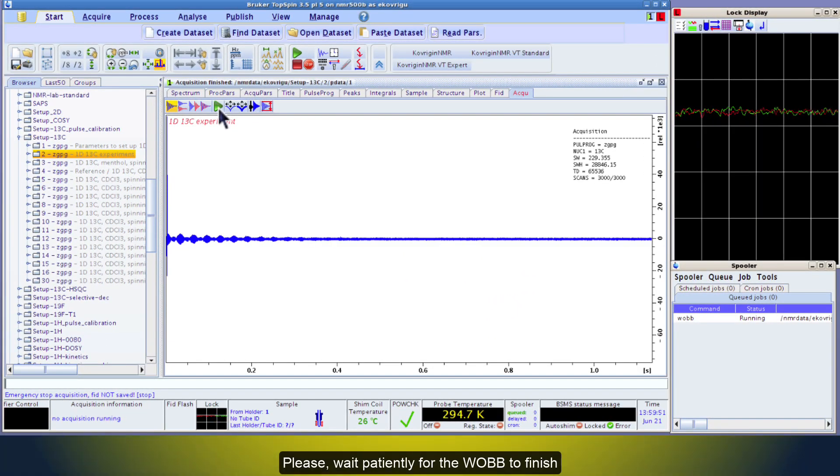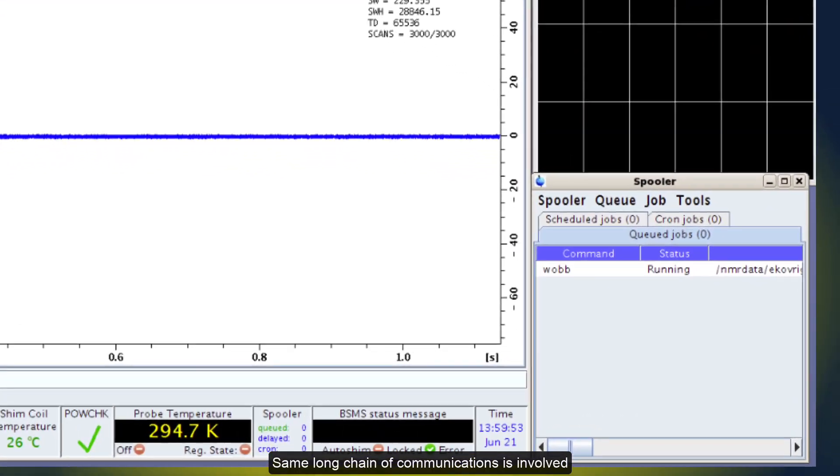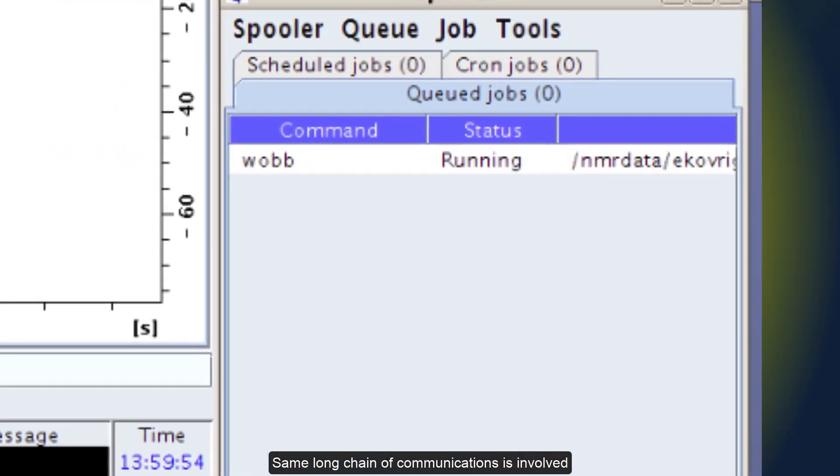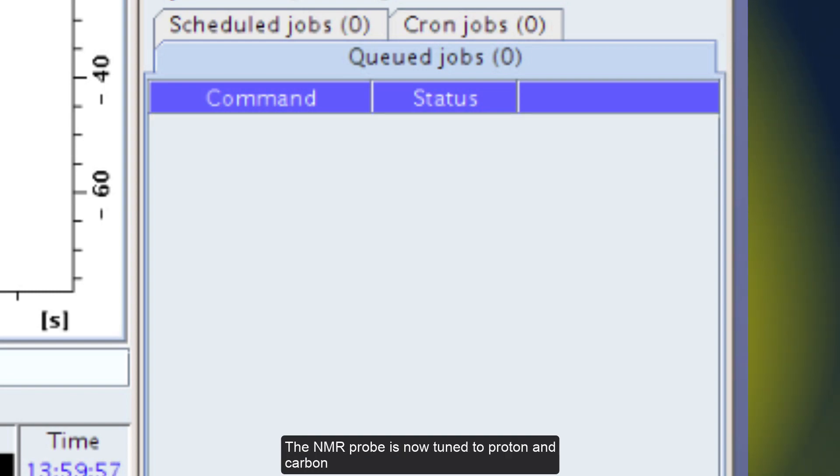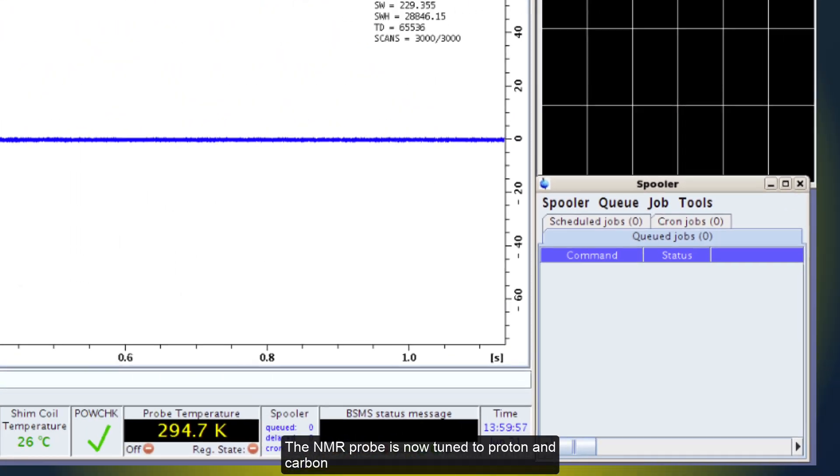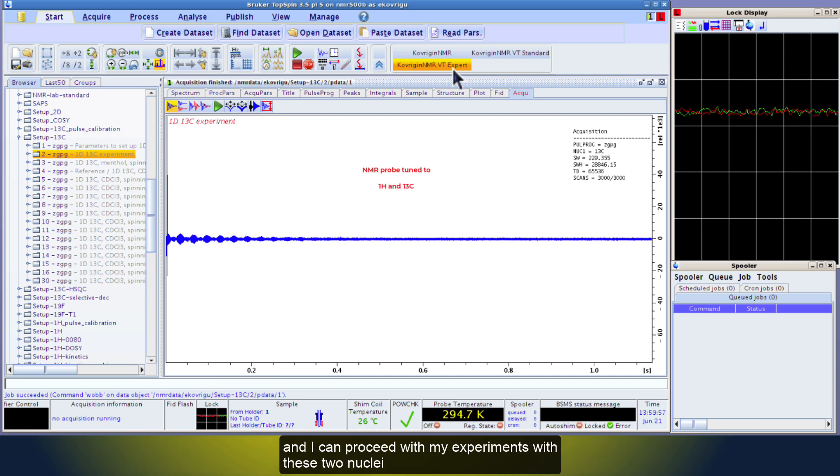Please wait patiently for the Wob to finish. Same long chain of communications is involved. In a few moments, the spooler window becomes empty. The NMR probe is now tuned to Proton and Carbon, and I can proceed with my experiments with these two nuclei.